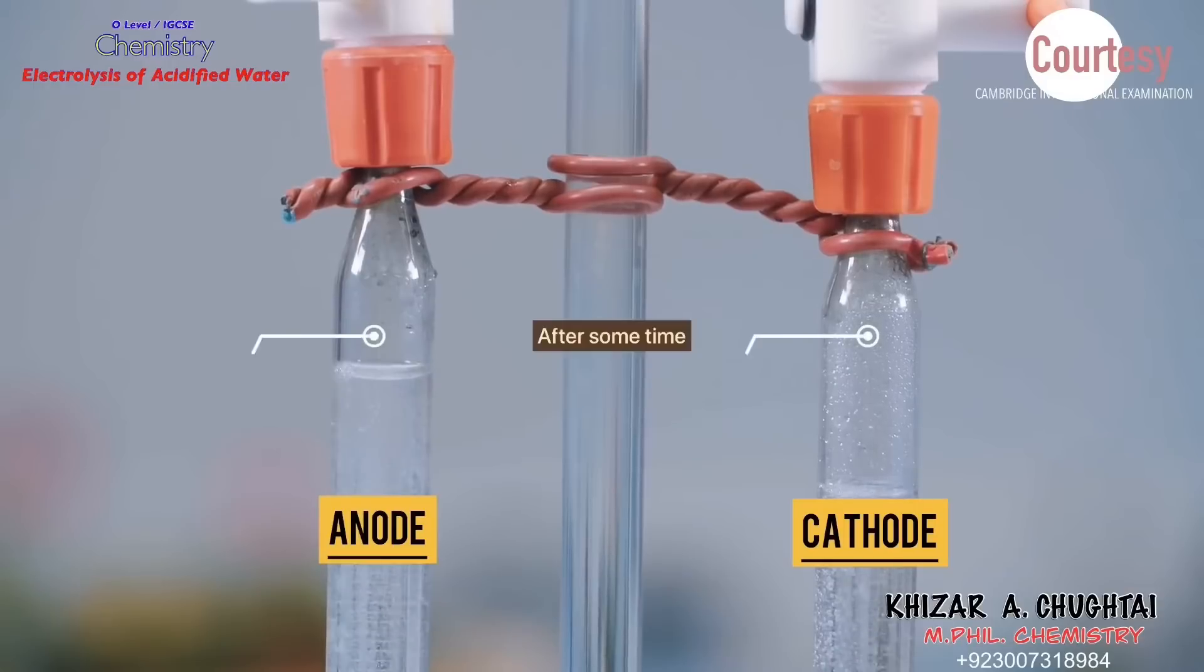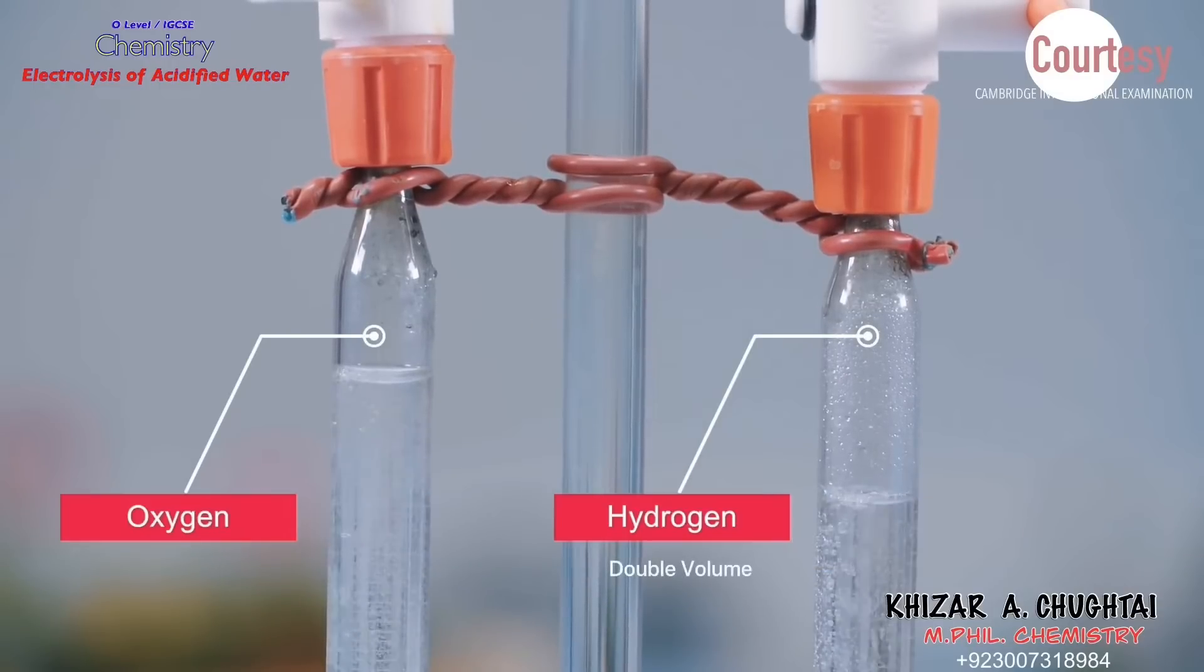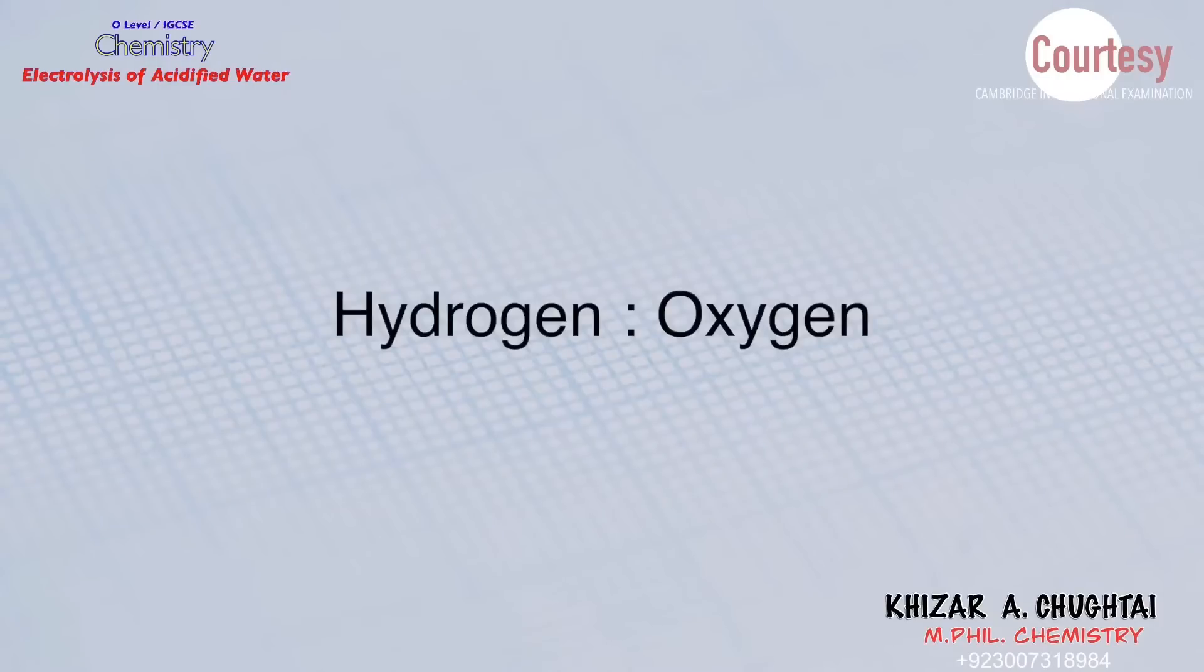After a few minutes, double volume of hydrogen is collected than that of oxygen. So stoichiometric ratio of hydrogen gas to oxygen gas is 2 to 1. This is the similar ratio of hydrogen and oxygen elements in water.